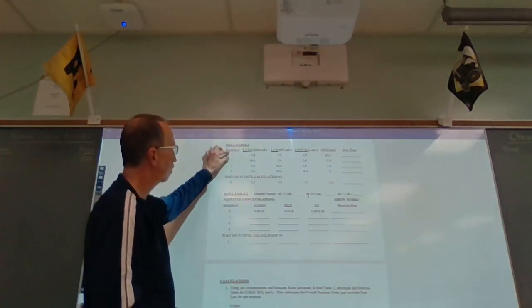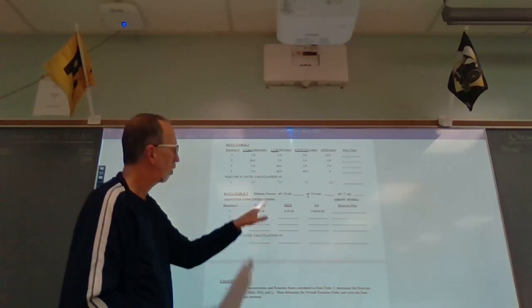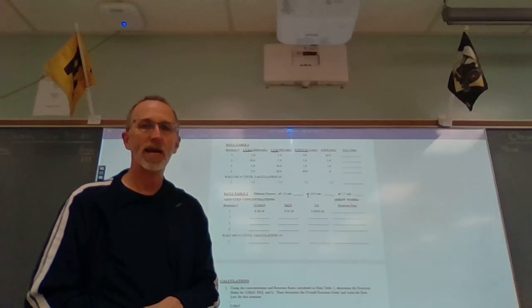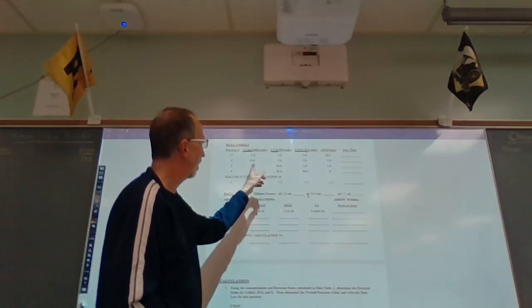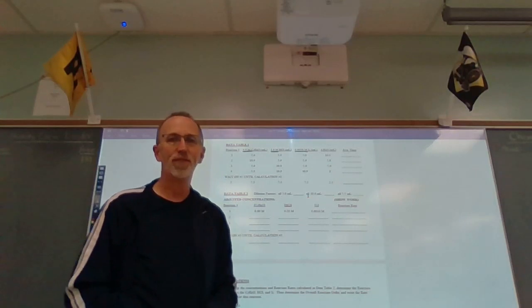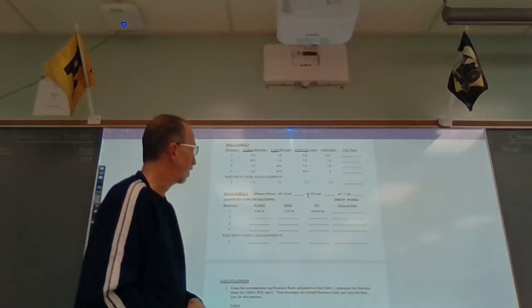As you can see here, between reactions 1 and 2, that's exactly what we've done with acetone. We're changing the amount of acetone while keeping the other two reactants constant. So anyway, 10 mLs acetone, 5 HCl, 5 iodine. Now that totals 20 mLs. And so this time we're only going to add 5 mLs of water, which gets us to that same total volume of 25 mLs. We've done the same thing in reactions 3 and 4.